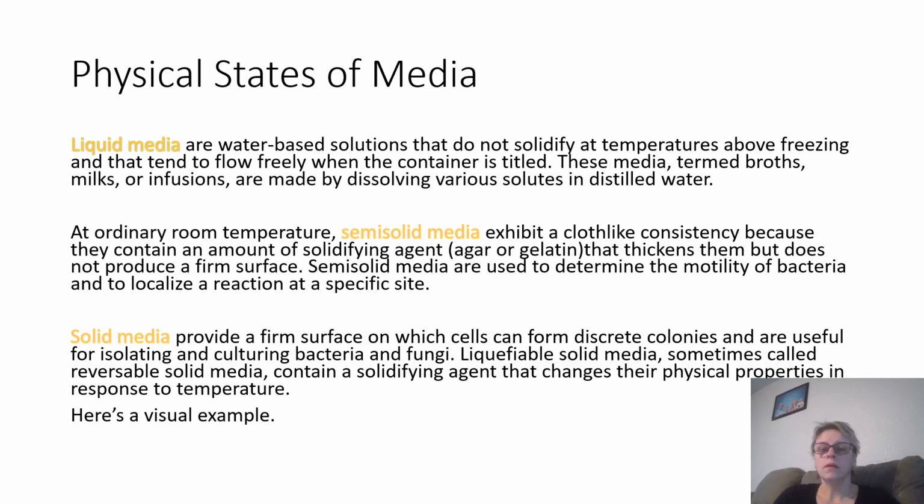These media, termed broths, milks, or infusions, are made by dissolving various solutes in distilled water.